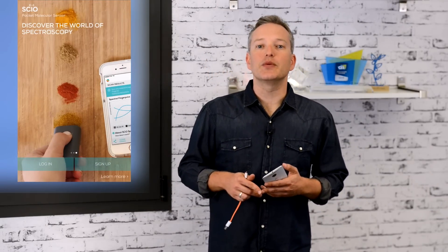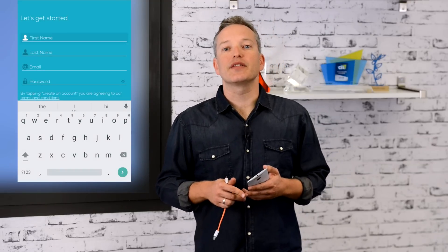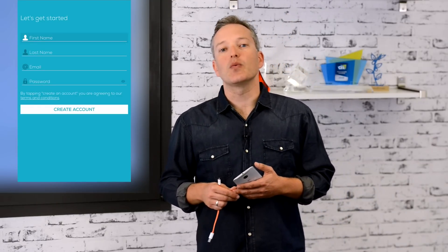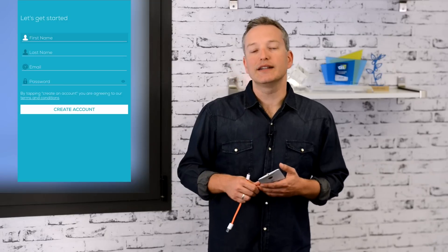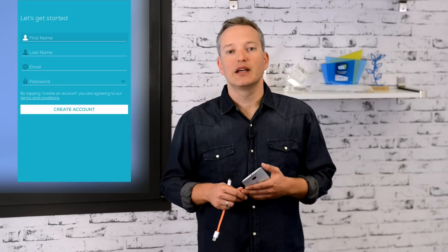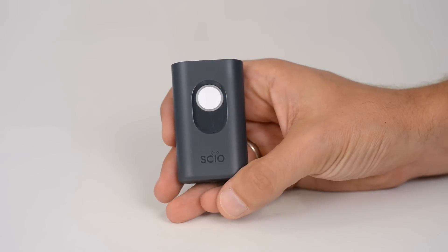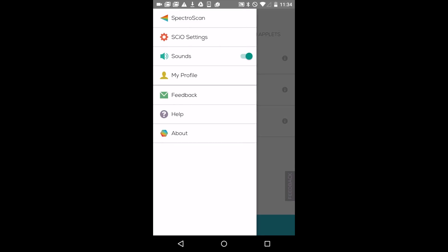When signing up, fill out the required fields and enter your email — preferably the one you used when backing us on Kickstarter or the one used to purchase Sayo online — and choose a password. Now turn on Sayo by pressing the function button for one second until the LED light turns on, and follow the instructions to pair Sayo with your phone. You can always pair it again or pair a new Sayo from the menu.